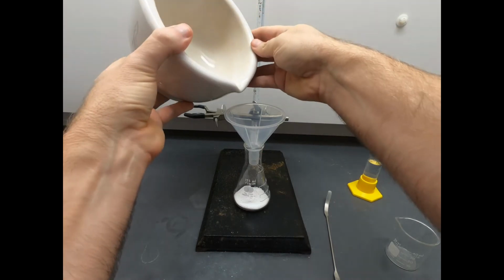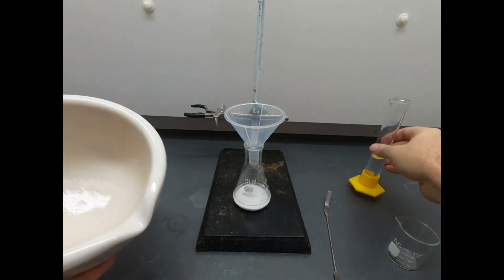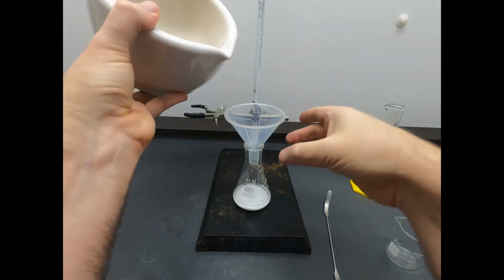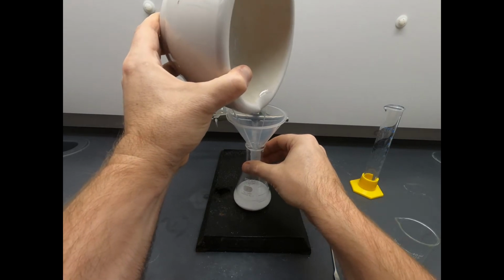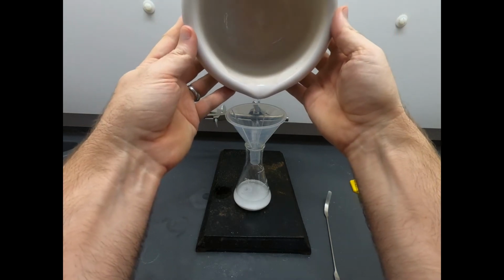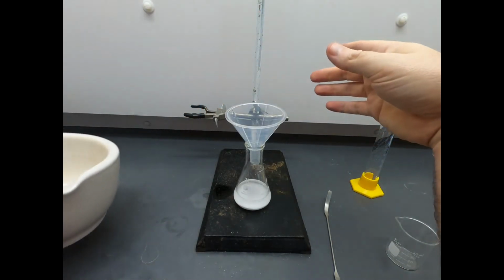Swirl this around. That looks pretty good. And now we'll dump this through. Maybe make sure all the powder gets rinsed down too. That's pretty nice. Add the rest, swirl this around, hold it high enough so we don't dump over our flask again. Okay, clearly not perfect, but pretty good, and the point is it's much better than it was. Now you can't see how much powder's left behind because we got it all wet and it sort of fades into the background, but whatever is left in there is certainly less than when we first started the rinse.